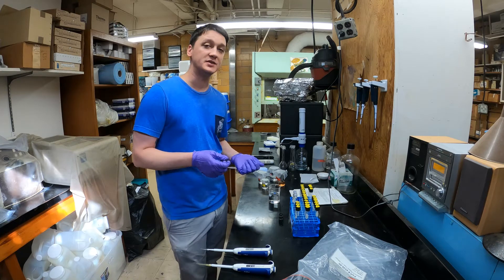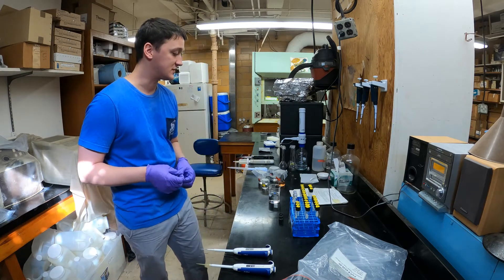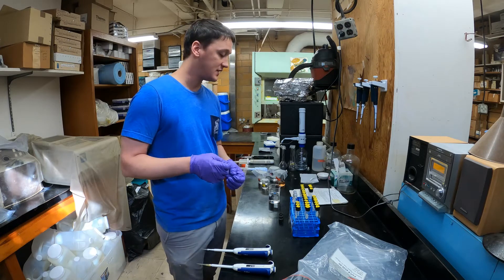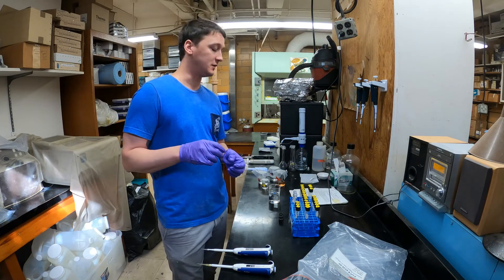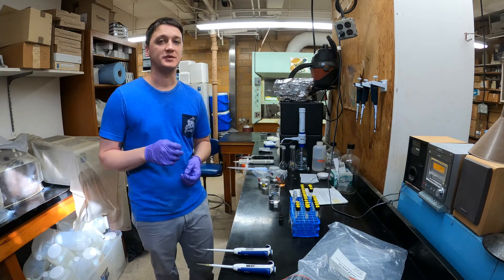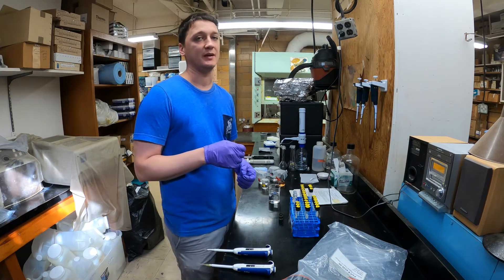In this case we use bleach, and then to make the solution alkaline we use a solution of sodium hydroxide and sodium citrate. We're also going to add a catalyst because the reaction will occur at room temperature, but we can speed it up to help analyze the samples.